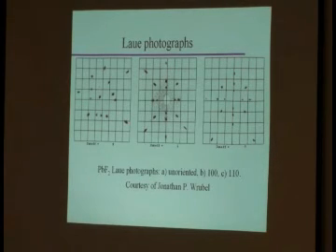You then, however, can reorient your crystal. And if you actually hit an orientation where you have a face with simple indices pointed towards your X-ray source, then you get something that looks a lot prettier. Like this one or that one. Okay? First one is unoriented, the second one is along the 100, and the third one is along the 110.